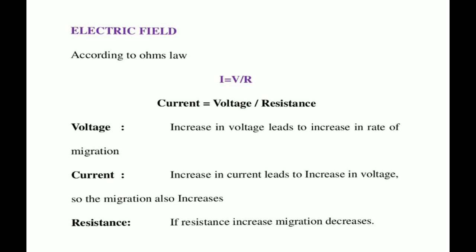So it is generated due to the potential difference which is applied between the electrodes. म्हणजे काही इलेक्ट्रोड्स दाखवले तर तुम्हाला त्याच्यामध्ये जो काय पोटेन्शियल डिफरन्स अप्लाय केला जातो त्याच्यामुळे तुमचा करंट जनरेट होतो. ठीक आहे, so it is a continuous and uniform flow of electrons around a circuit that are being pushed by the voltage source.